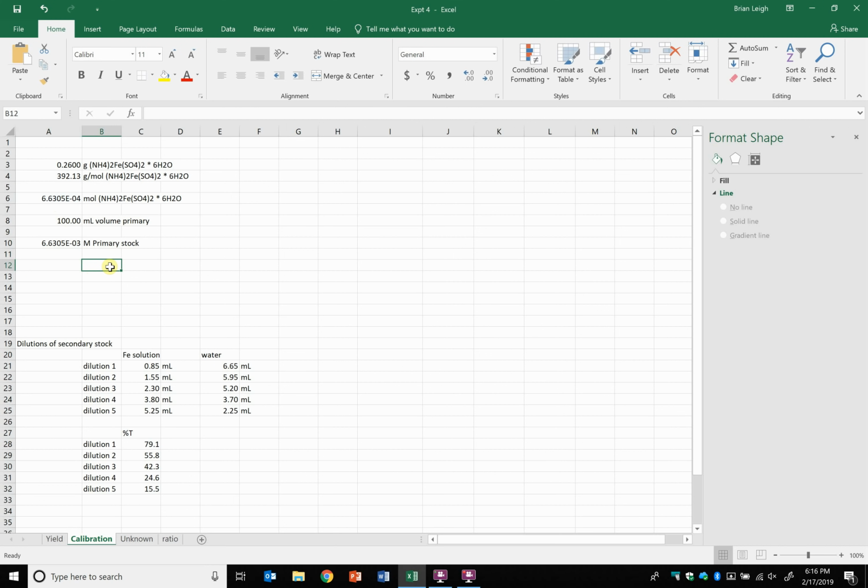Okay, so from here, we then took this and we put it in some sort of aliquot. We took an aliquot, a sampling of it. We took 2 mLs, right? So those 2 mLs that we took out, we want to know how many moles were moving from that primary to the secondary. So how many moles were in that aliquot? That's simply going to be the concentration times the volume, but remember the volume has to be in liters, so we'll change that to liters again. And we get the number of moles that's transferred is roughly 1.3 times 10 to the minus fifth.